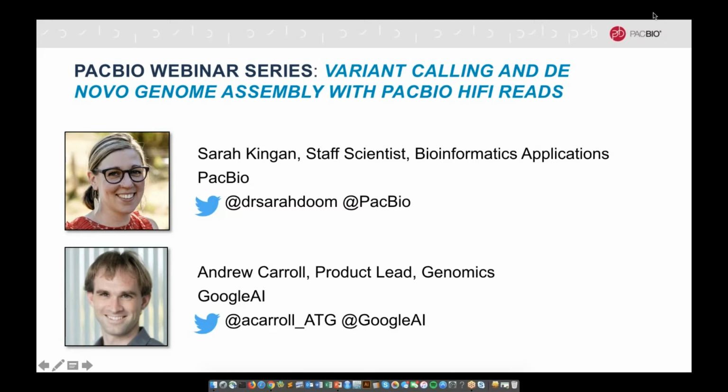Today we're going to focus on variant calling and de novo assembly using PacBio's HiFi reads.